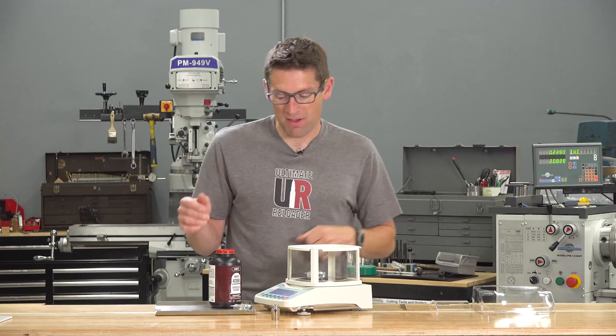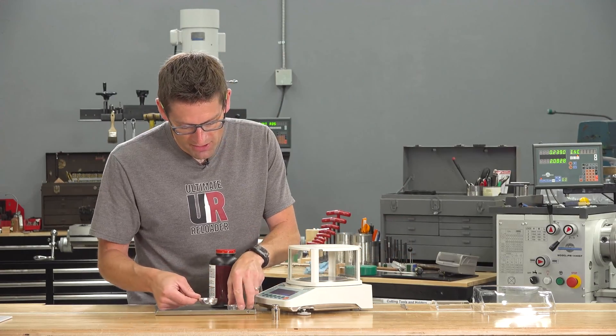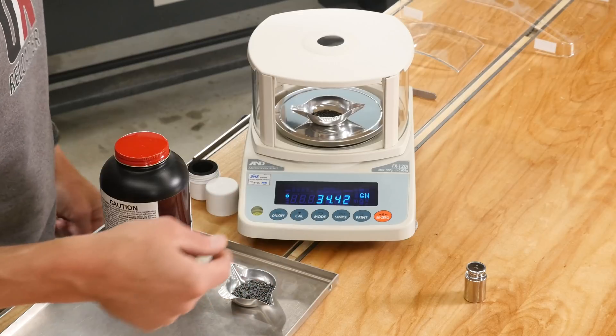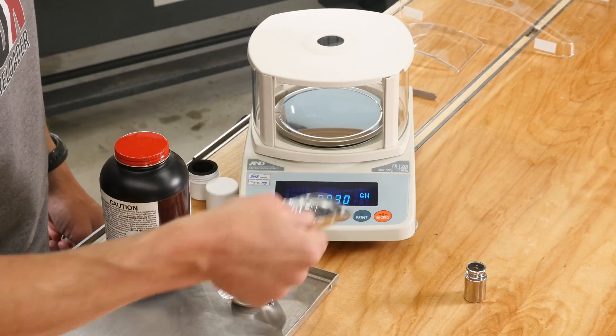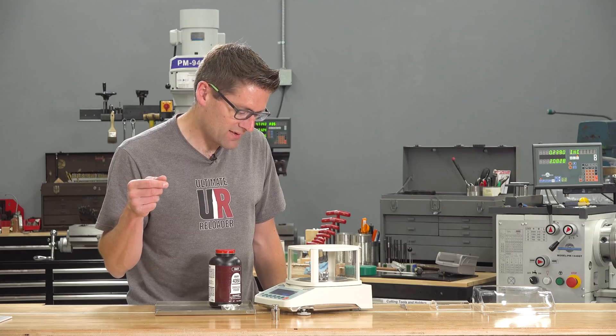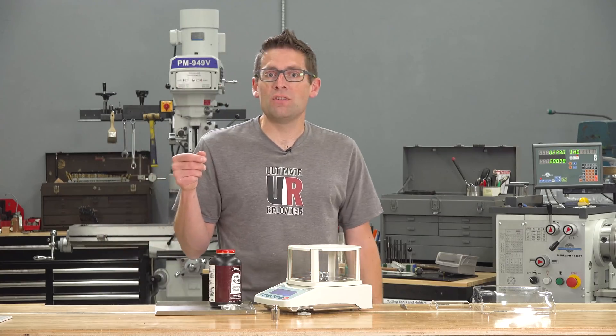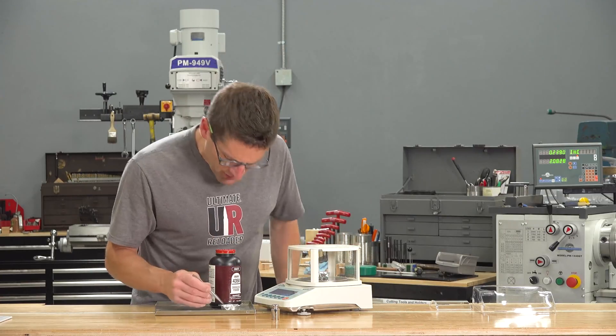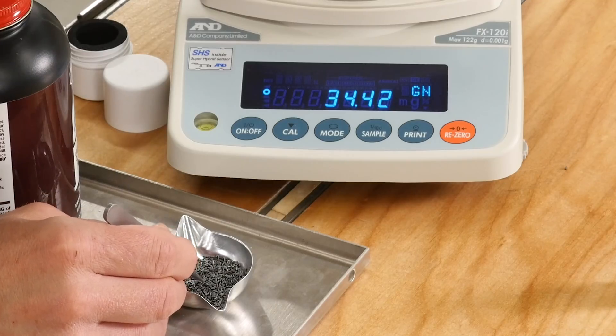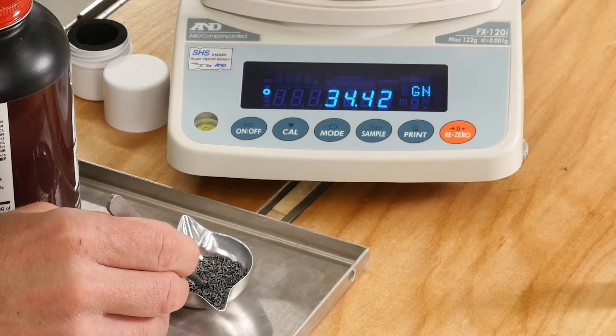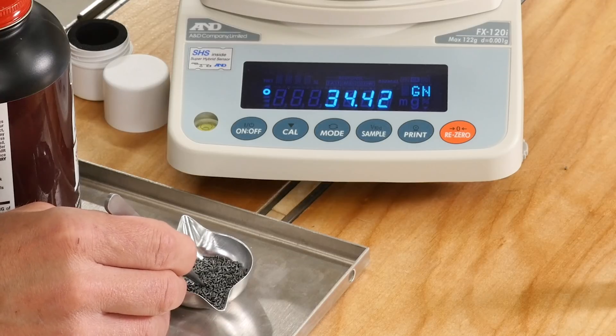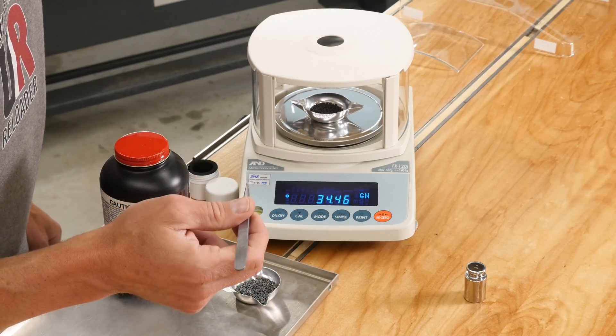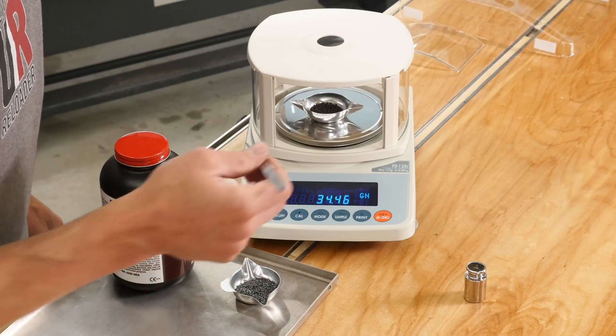And of course, if we put more weight on here like we would with a charge, it's just going to go right on up to that weight. And if you see how quick that is, that is absolutely amazing. It's almost instant. 34.42, a little bit more than a .223, a little less than a .308. And again, if we take another kernel here, we can see the balance responds to an individual kernel. These are so small I'm having trouble picking up one. There we go. 34.42 to 34.46.